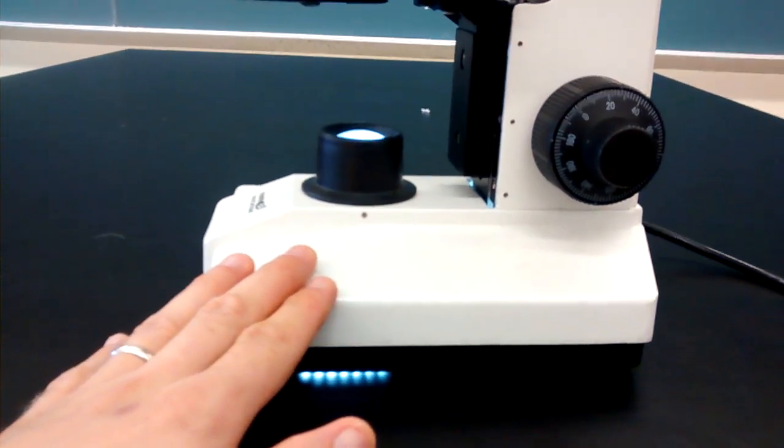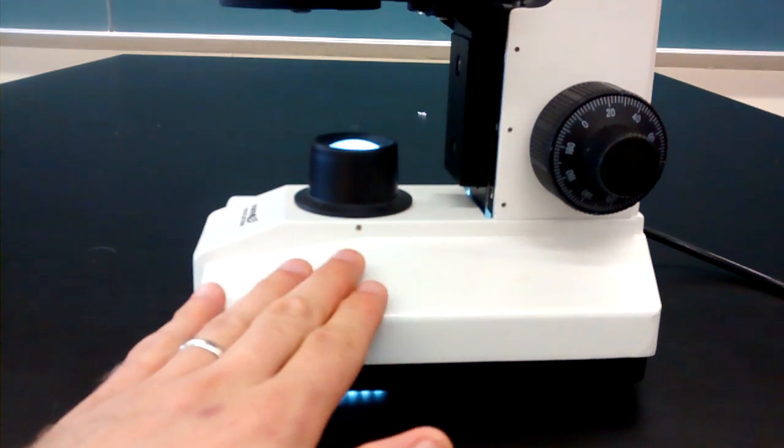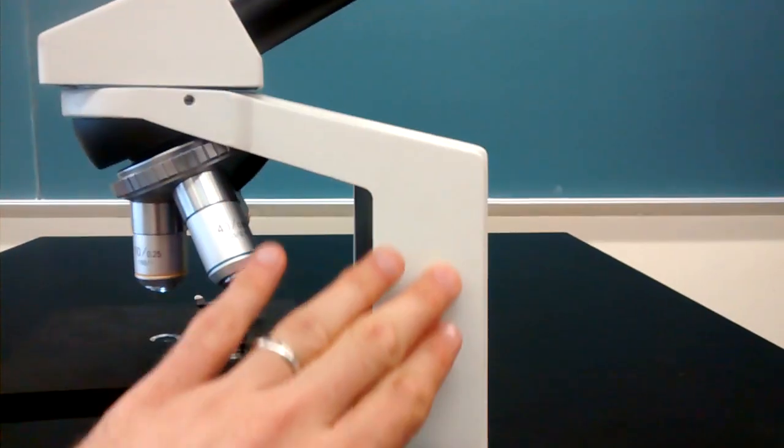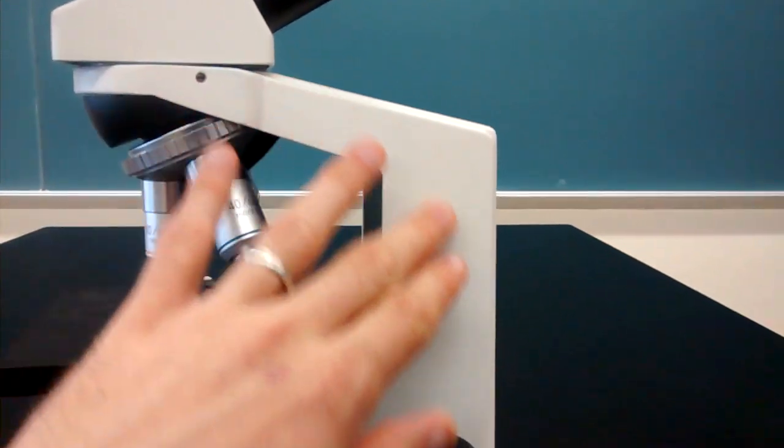Underneath that is the base of the microscope. Whenever you hold a microscope, you hold it by one hand underneath the base. And one hand holds this portion here, which is called the arm of the microscope.